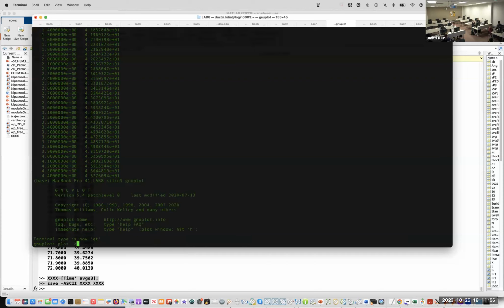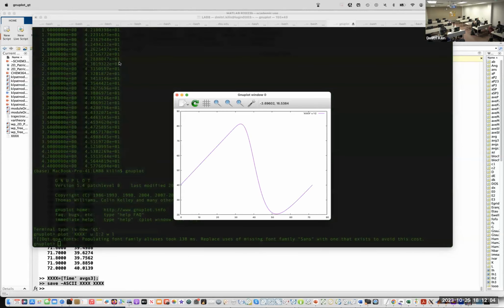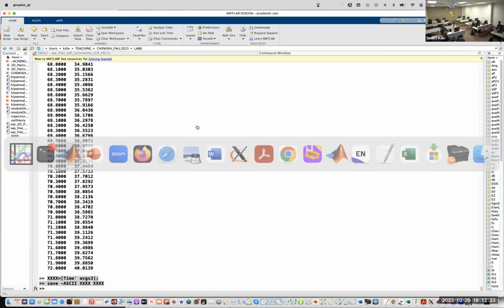Using GNU plot, plot with 1 versus 2 with lines. I know it is not a big change. I replace one command line with another, but I like GNU plot because I was using it for my thesis 23 years ago. So it's ancient. You see, it is the same dependence as you would get in MATLAB.